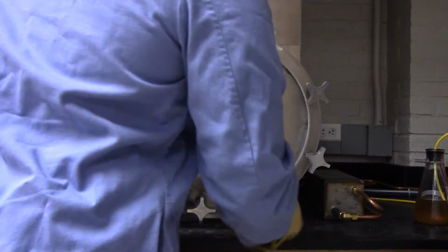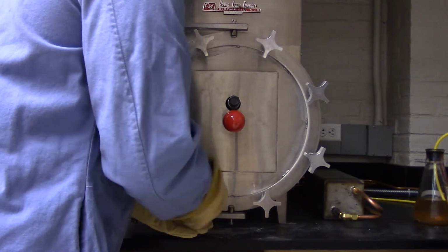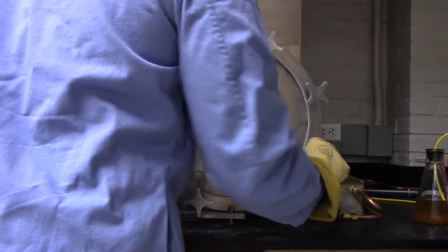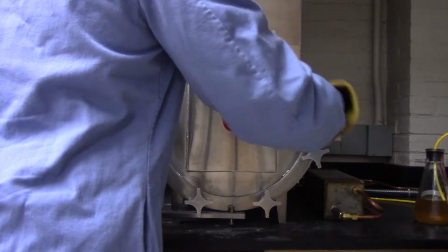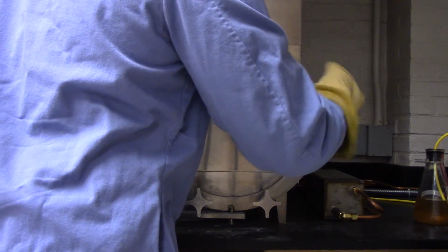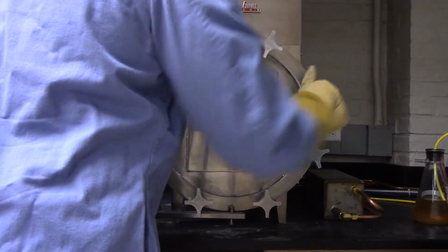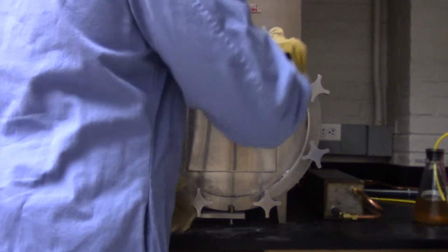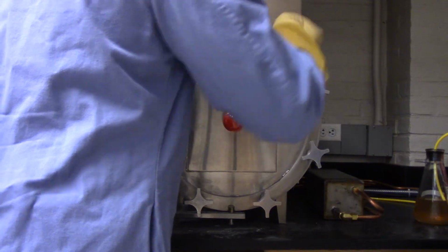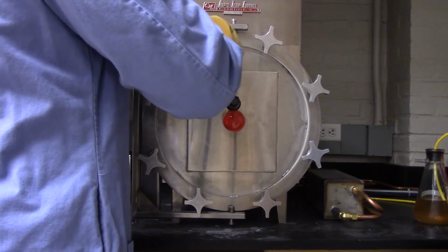It is a little bit lengthy to close. You just want to make sure that all of these knobs here are nice and tight so that no heat escapes from this furnace and goes to where it's not intended to.